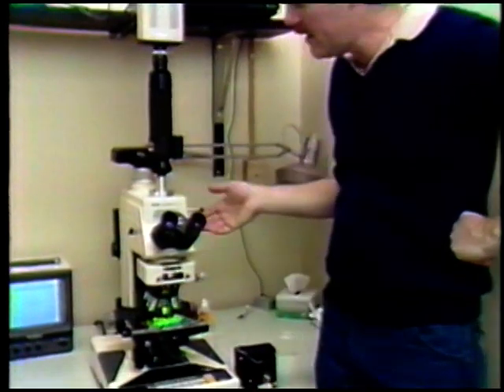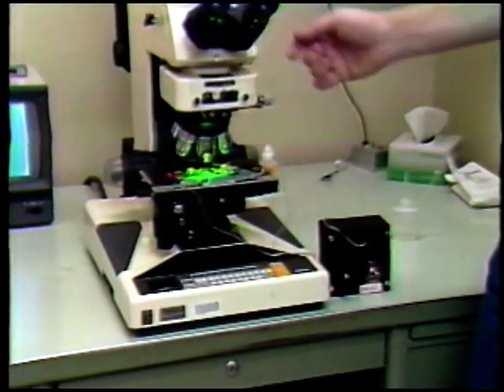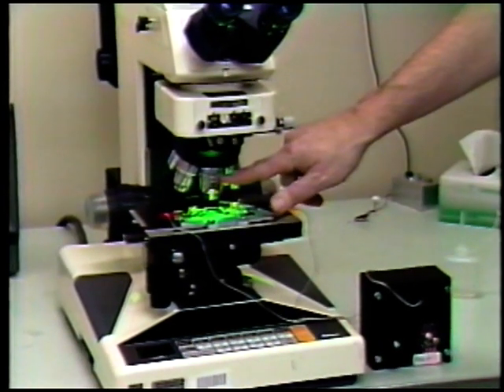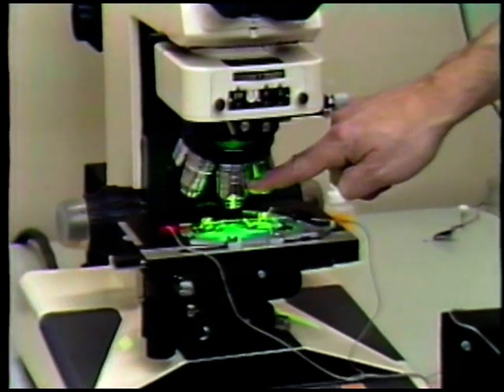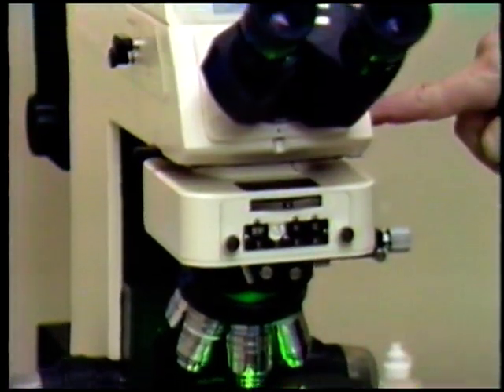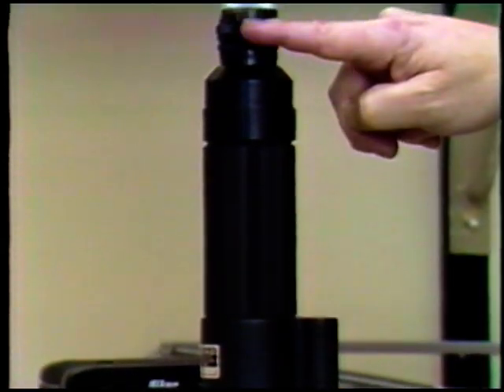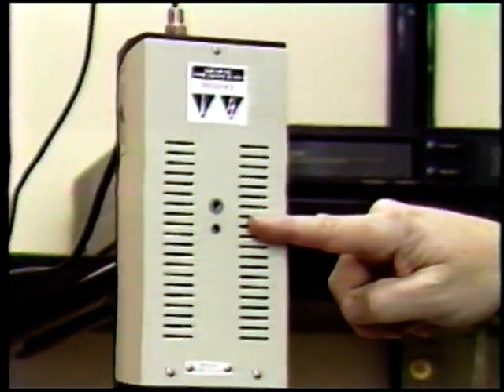This is a Nikon Microphote FT microscope equipped with epifluorescence. Here's the slide and power supply installed in the microscope. It's illuminated from above in green light and viewed in red light. This is a 60x oil immersion objective. In here is a ×2 additional magnifier lens. This is an image intensifier, and this is a high sensitivity Vidicon camera.